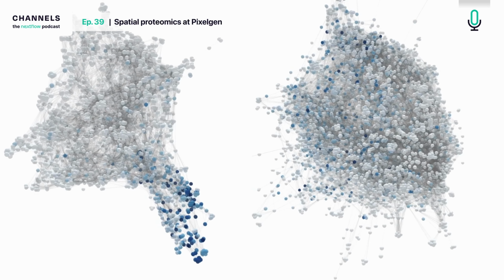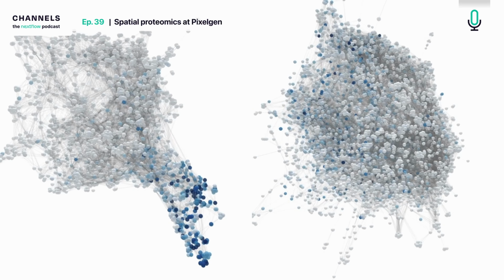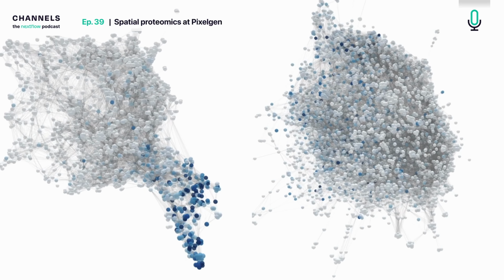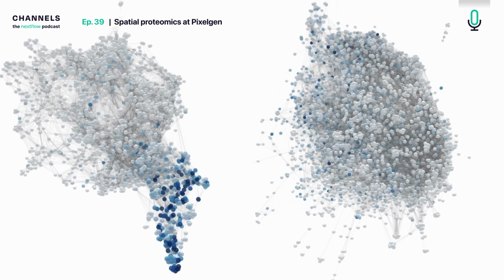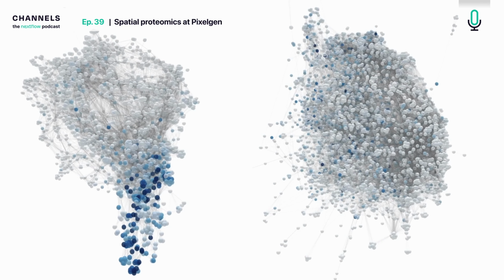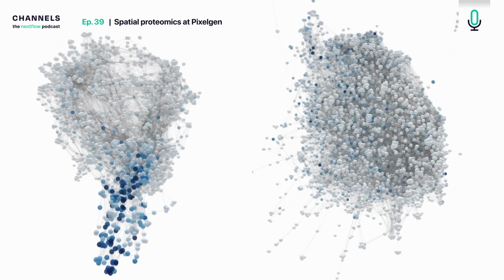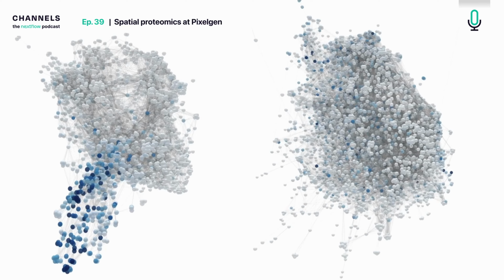On the left, one that we have chemically stimulated to start moving across the surface, and it has very clearly formed this protrusion. It's also colored by a marker indicative of this protrusion, one of the edges the cell moves with to create locomotion.